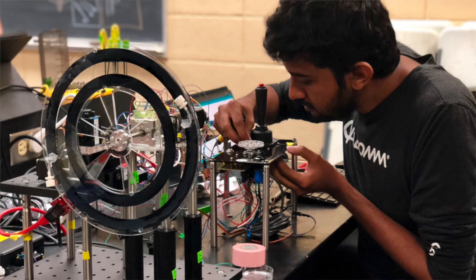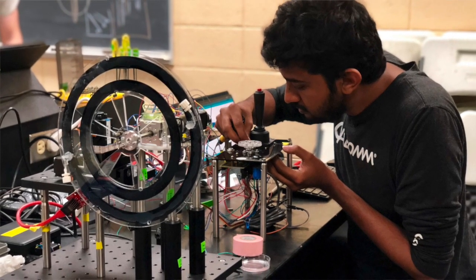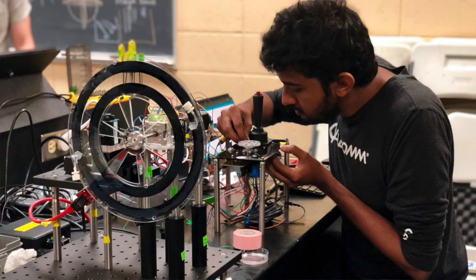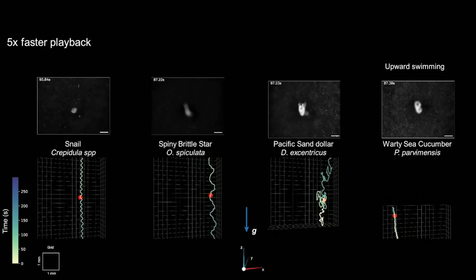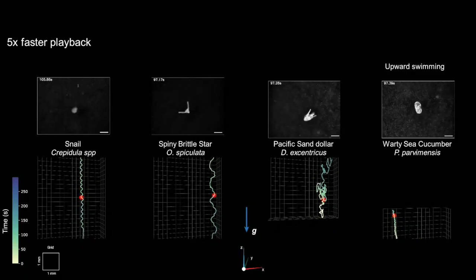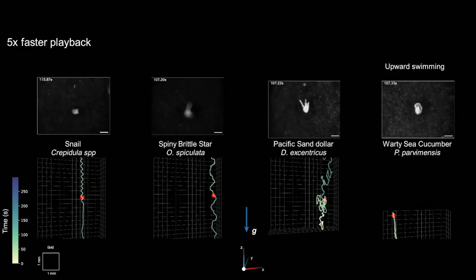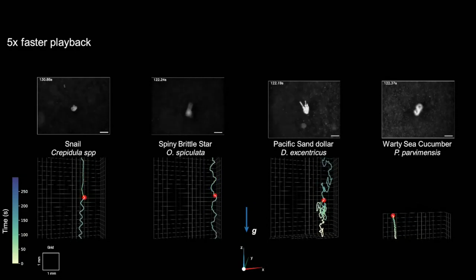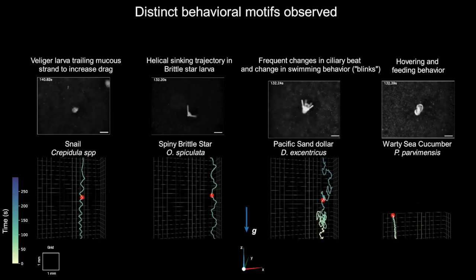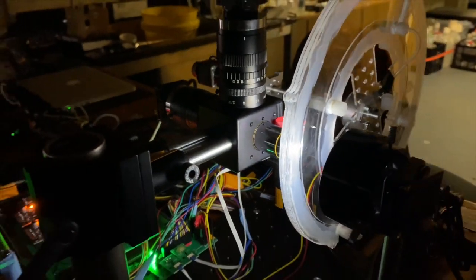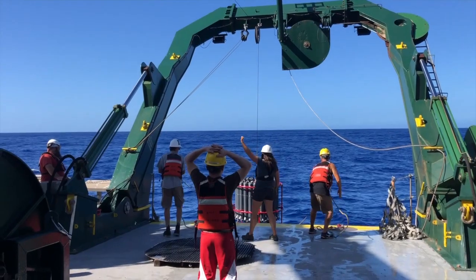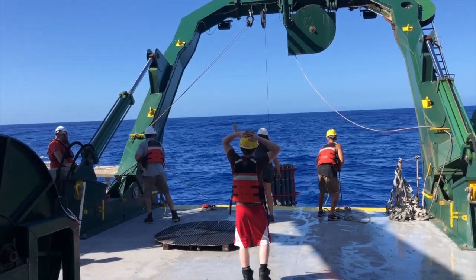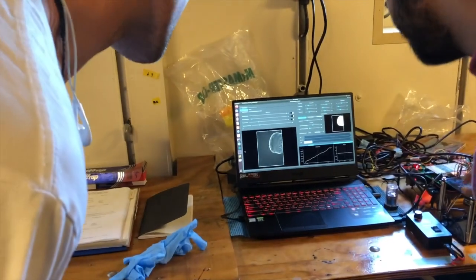The gravity machine that people have seen now versus the gravity machine that existed early on are dramatically different. It's kind of like an intelligent microscope — it knows where to look for the organism based on what the organism is doing. That evolution is quite beautiful, because the current version we can literally take this machine on a research vessel which is wobbling 10 degrees back and forth — hard for us to stand — while this machine is tracking a single organism.